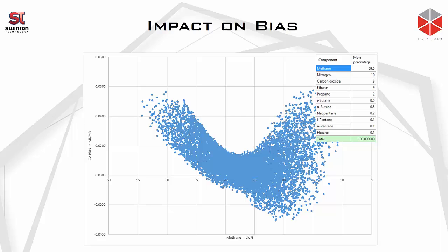If we have a bias tolerance of, let's say, 0.06 megajoules, then every single one of these calibration gases can be used in every single range. But the best way is actually to implement the multi-level calibration constant. What it means is that all this particular bias will all drop to 0.